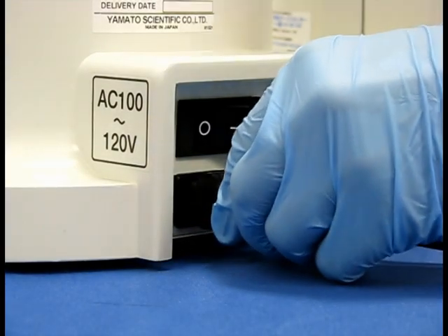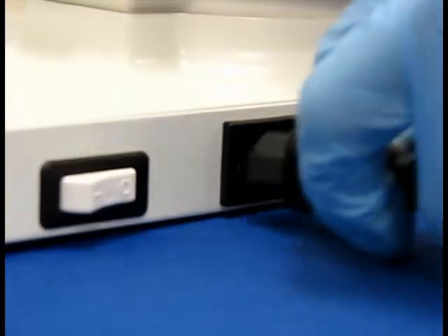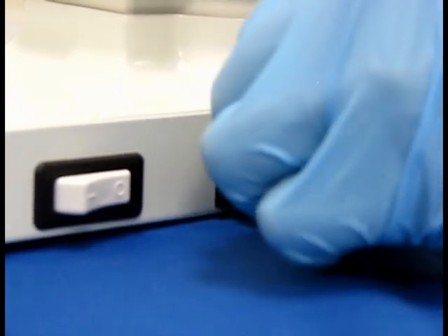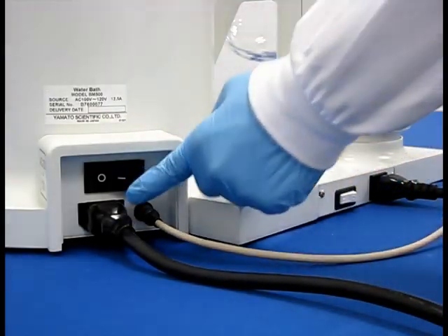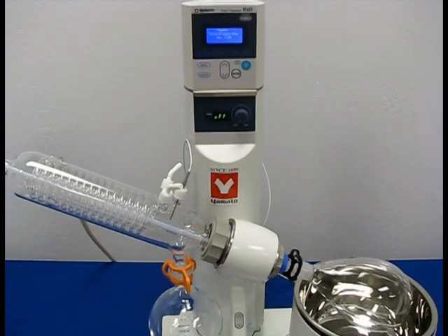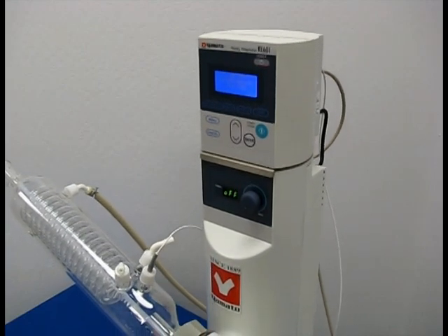Connect the main power cords for the water bath and rotary evaporator at the bottom of the units to your power source outlets. You can now turn on the main switches of the RE601 to the on position. The rotary evaporator will automatically rise to its maximum height when first powered on.